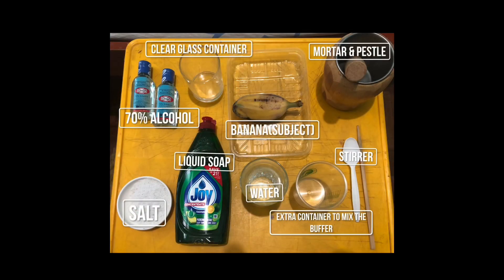For this experiment we will be using the following materials. First we have to peel the banana, then I will be placing it here and I'm going to pound it.